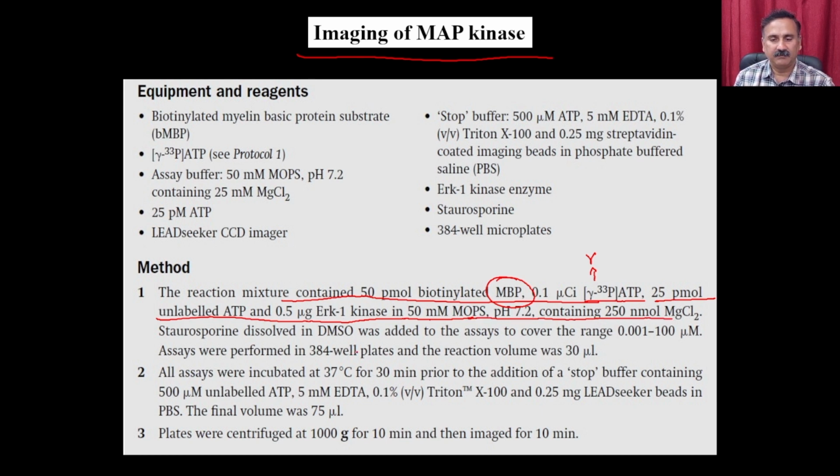Staurosporine dissolved in DMSO was added to the assay to cover the range, and the assay was performed in 384-well plates, and the reaction volume was 30 microliter. The assay was incubated at 37 degrees Celsius for 30 minutes, and then you are going to measure the activity.